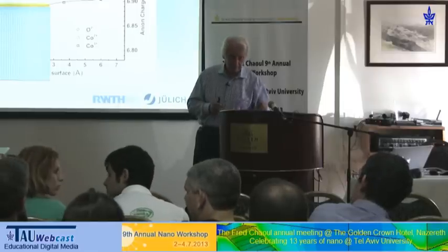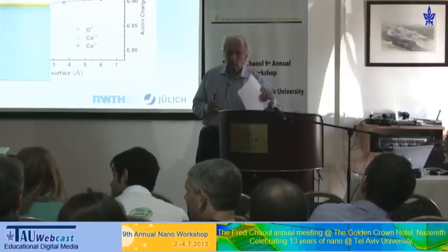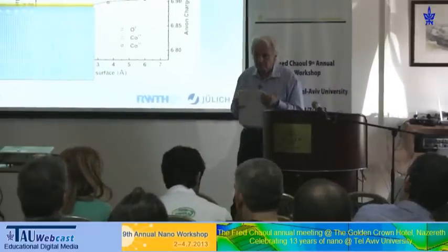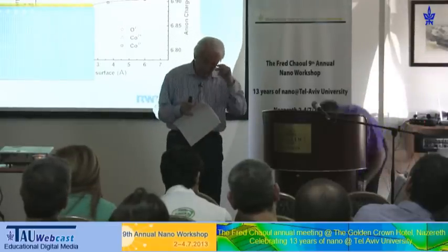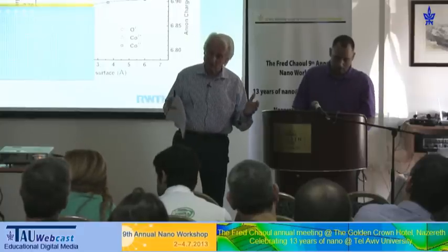Okay. So you said the resolution is now 50 picometer. This is still about probably 20 times more than the wavelength. So what is limiting now the resolution, and what is your prospect? How low can we get? There are various factors, of course, it's chromatic aberration, which is limiting the resolution.